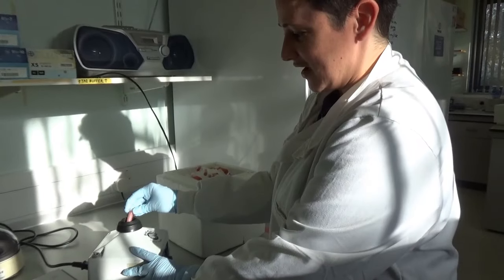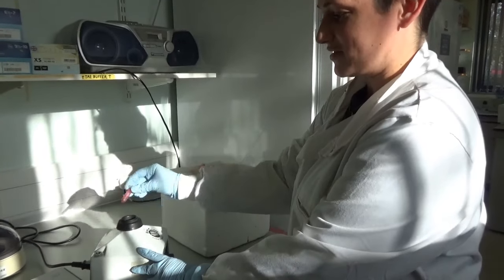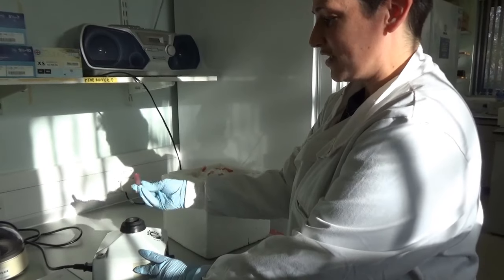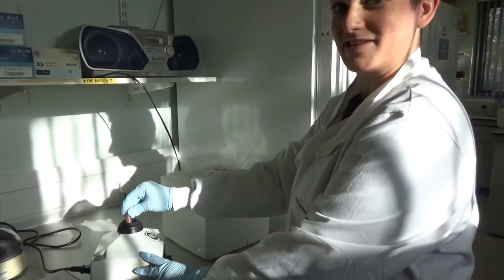So I've got here kidney tissue, which we've basically dissolved in an agent called Trizol. And the plan for today is to extract the RNA from it, so basically the genetic material. So this is the starting point, but just because I've defrosted them at the moment, I'm just mixing them up basically.